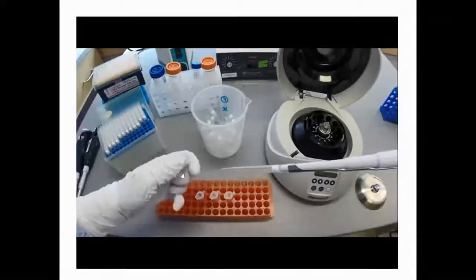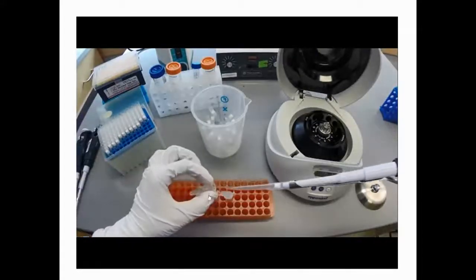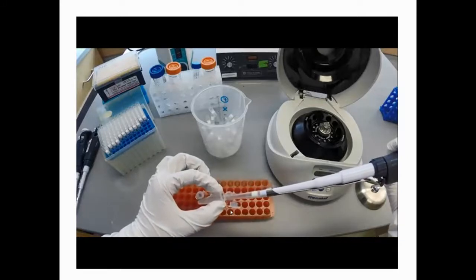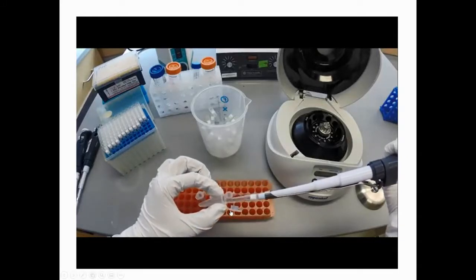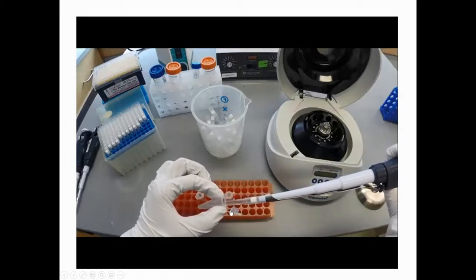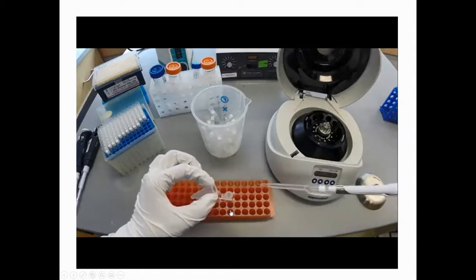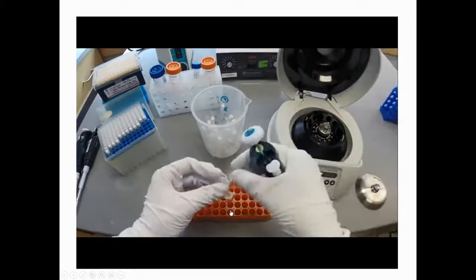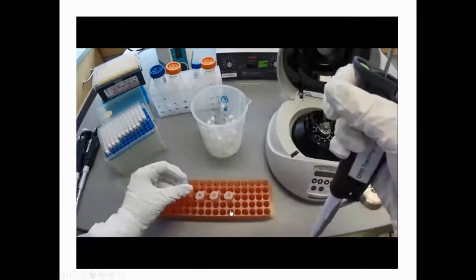The precipitate should be on the side of the hinge. Place the tip at the bottom of the tube on the opposite side of the pellet to avoid disturbing it. It is not important at this point that all solution is removed. Just get as much as possible. Expel the tip with the solution inside into the discard bucket. Repeat this process for all remaining samples.